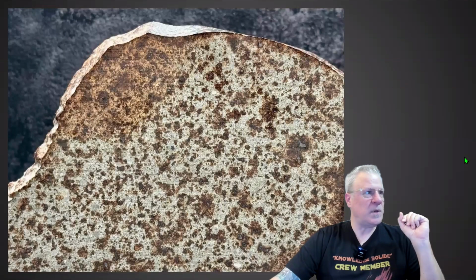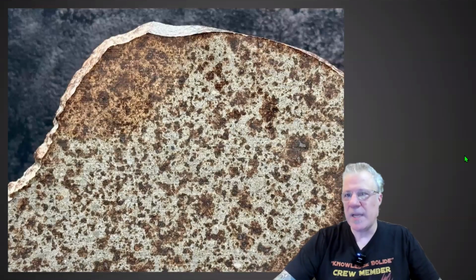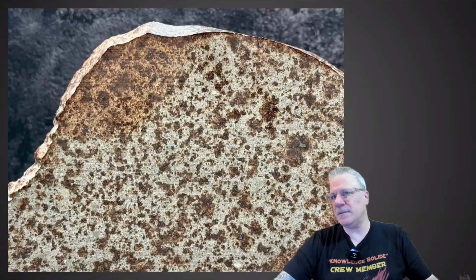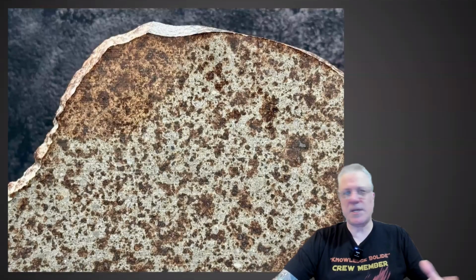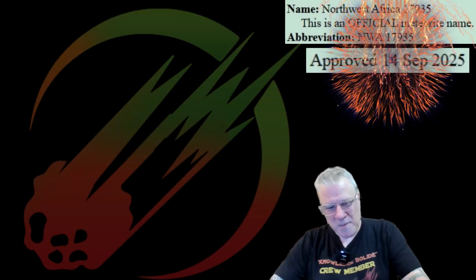Daniel, oh, there's a close up of that discoloration area. Could it be secondary lithology? Could it be weathering? Questions. All right, over to you, big guy.